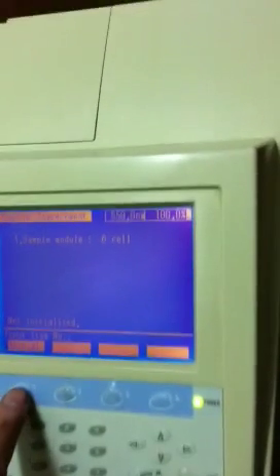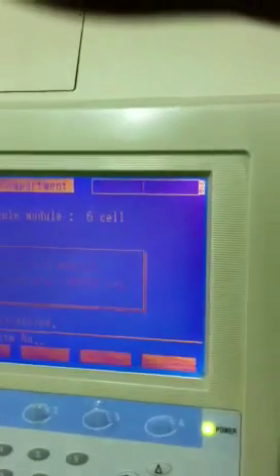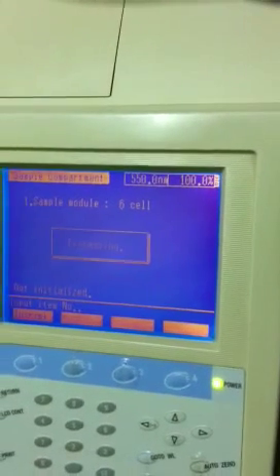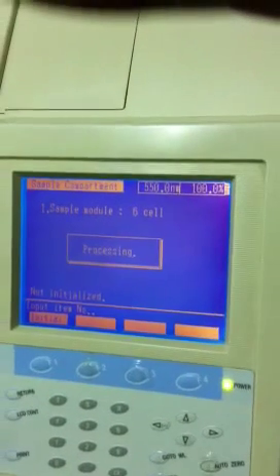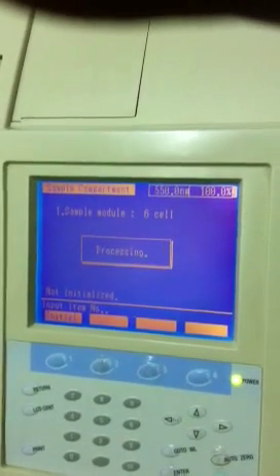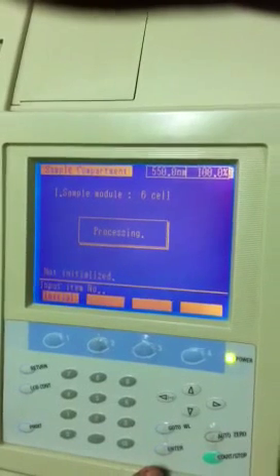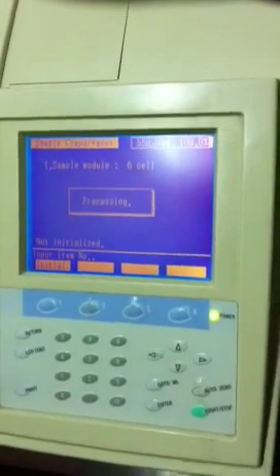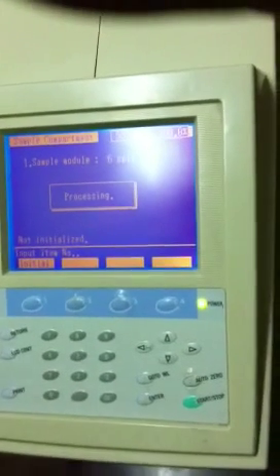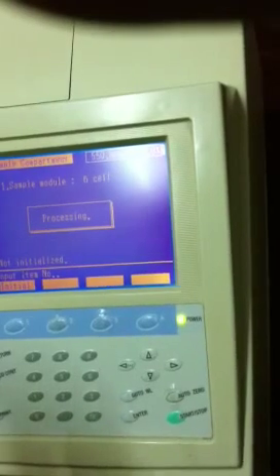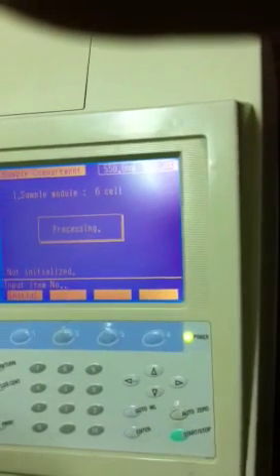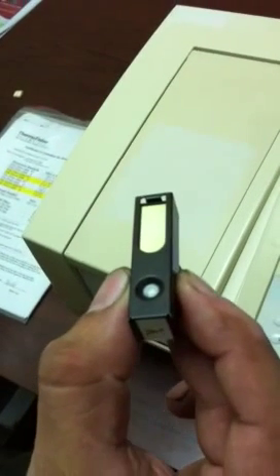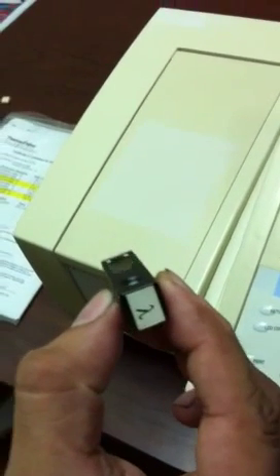You can select the compartment type which is 6-cell in our case right now. Just setting up the blank, right now there is nothing in the compartment and we are going to do the wavelength calibration with the help of this wavelength filter, a certified wavelength filter.